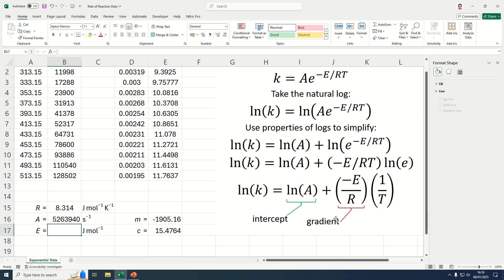We also know that the gradient, m, is equivalent to minus E divided by R. So if we take that gradient value and if we actually multiply that, so times minus R, because there's a negative in there as well.